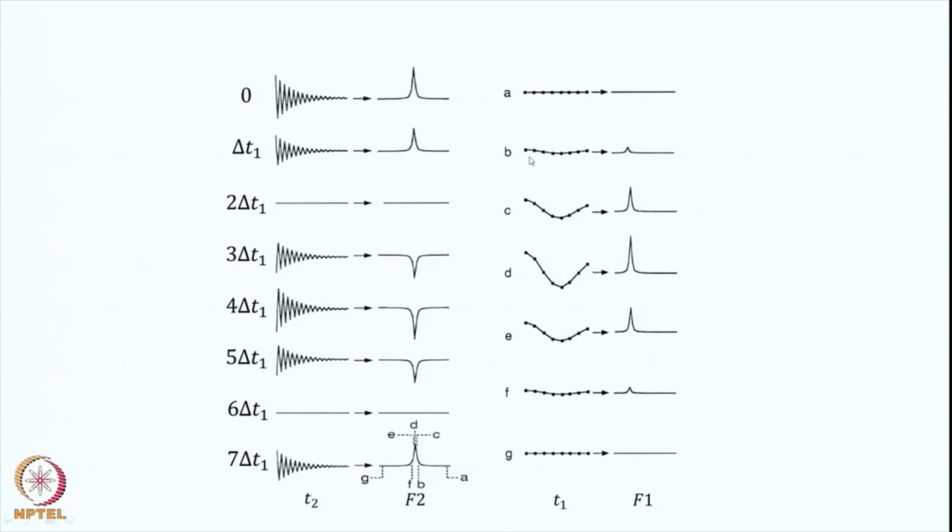So, this point B has got a small dip and there is an oscillation here. Now, you take the third point, which is well in your signal in your line. So, now you take the third point C, then you will see there is a greater dip here. So, there is a greater intensity variation at this point. Okay. And if you take the fourth point, it is even greater. So, there is more variation here.